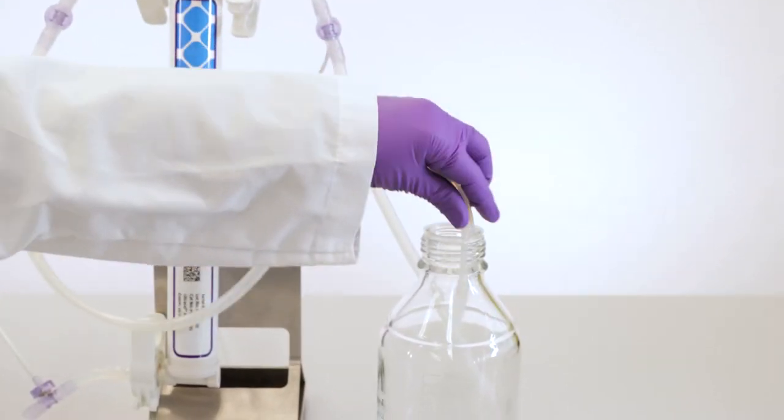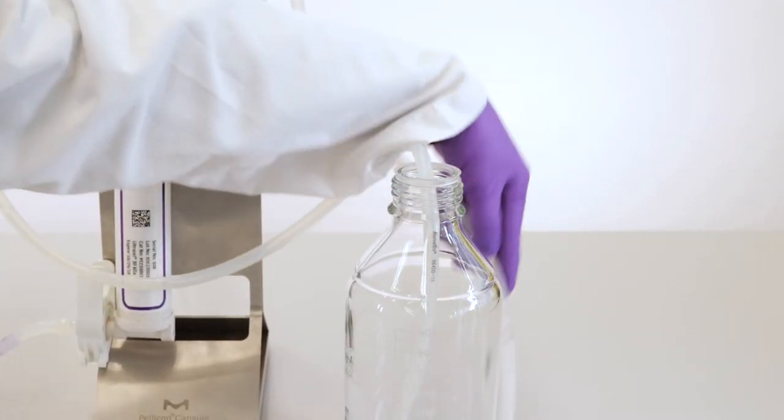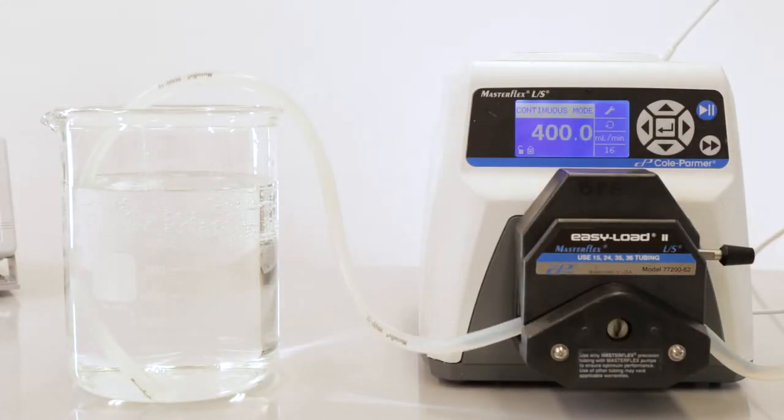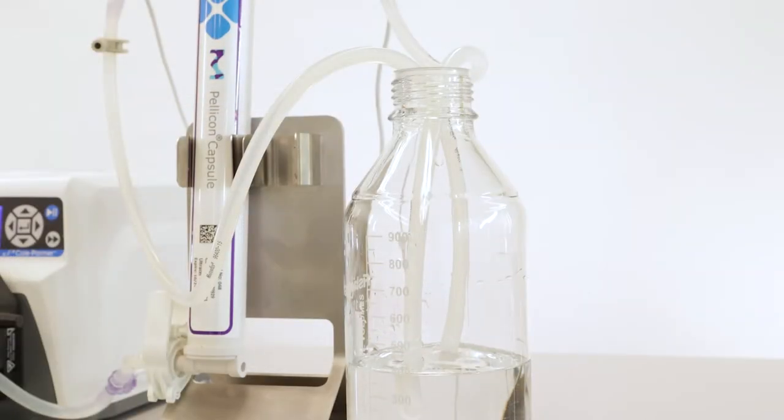Direct the permeate and retentant lines to a waste container or to drain and pump conditioning buffer into the capsule feed port to condition your TFF system.